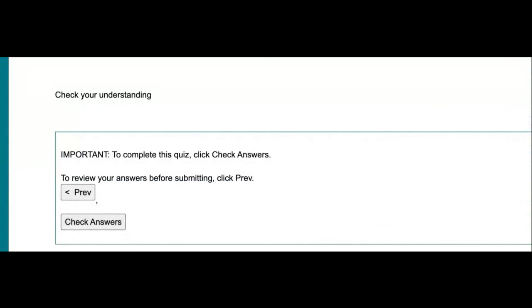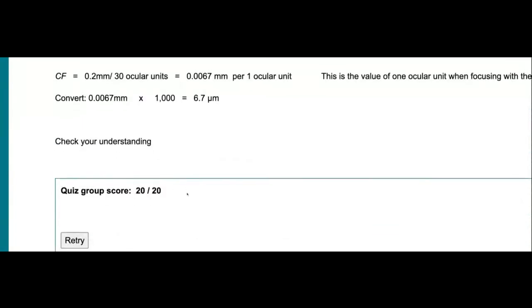All right, and check our answers. And we have 20 out of 20.